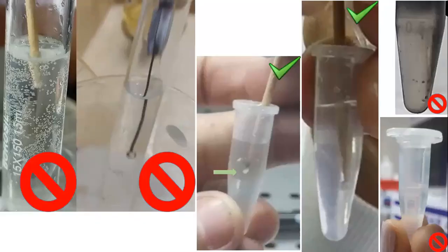Go for enzyme screening, whether your bacteria has catalase or not. Pick a bacteria with a wooden stick. Here you can see the bacteria is there. Dip it inside. This is clearly oxidase, sorry, catalase negative. When you see effervescence brightly coming out from the bacterial surface, it is catalase positive. Never use a metal stick, because some metals naturally have catalase activity. So never use a metal stick like this. This should not be done.